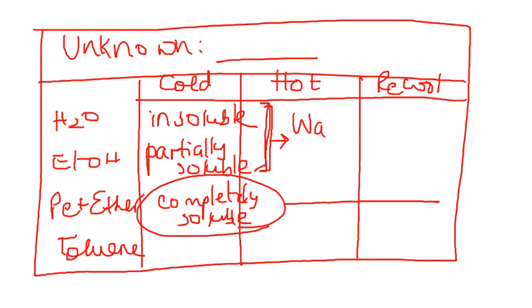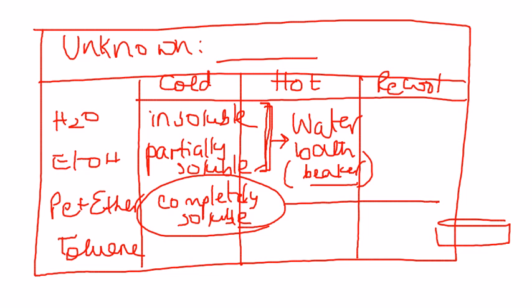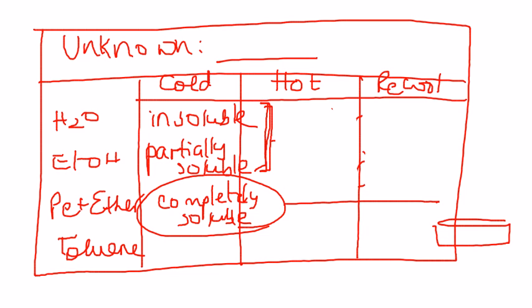We heat it in a water bath. The water bath that you would make is using a beaker, so that goes faster. You can, if you want to, use the metal rings also. That's okay, but a beaker will be faster in this case. And you will use that to figure out what happens when you heat the sample. So as you heat the sample in the water bath, you will then make a call, your judgment, as to what happens.